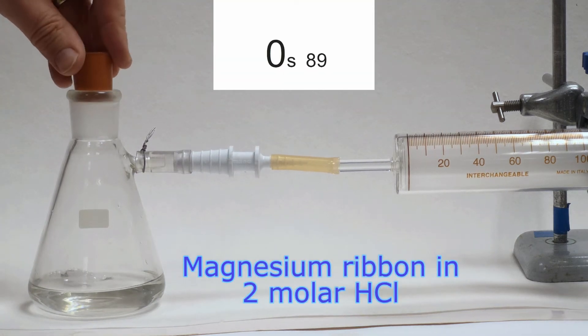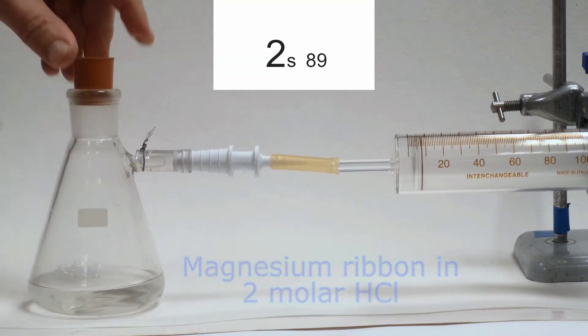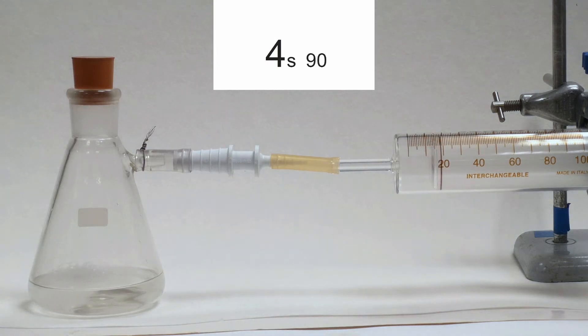We can use this to follow the rate of a reaction that produces gases, in this case magnesium ribbon with hydrochloric acid to produce hydrogen.